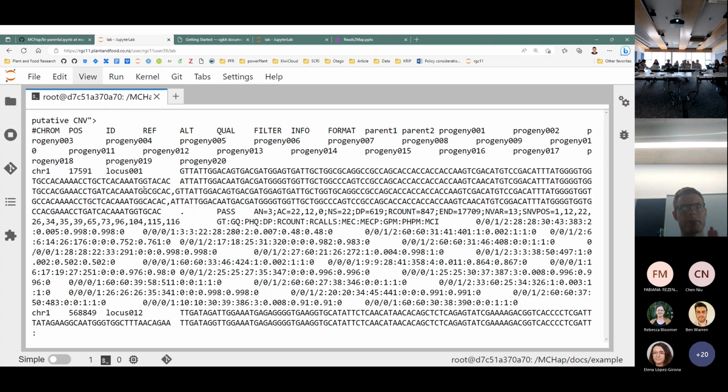So this is a standard VCF file. However, the main difference is that rather than having small variants at each locus, you've got these much larger variants. In this case, we've got 120 base pairs. The first one here is the reference allele. That is just whatever the reference genome is there. Even if it hasn't been identified in any samples, it'll be recorded from the reference file that we used.